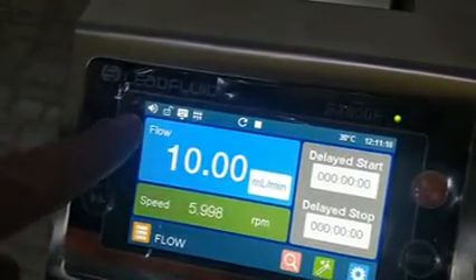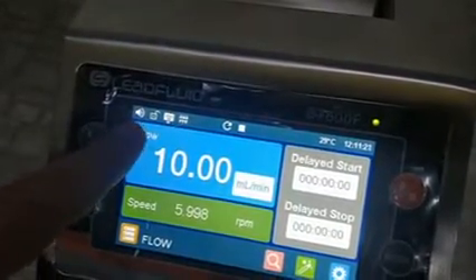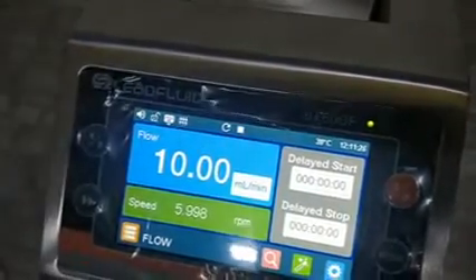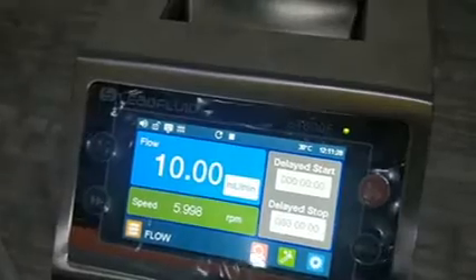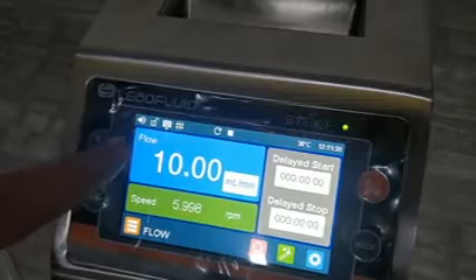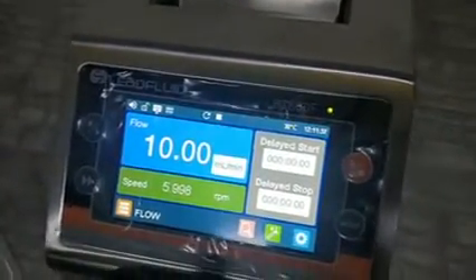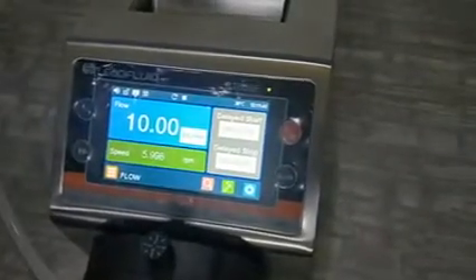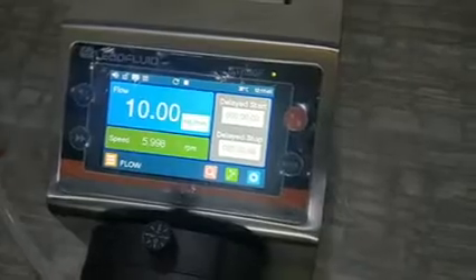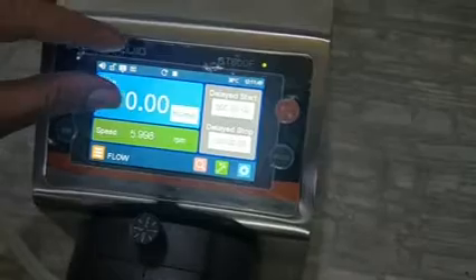The first icon is a buzzer — whenever you press a key it will make a sound. If you make it off, it will not make any sound. The next one is keypad lock — if you lock it, you cannot change the values of your programs. The third is control: internal or external. The last icon relates to external control connections.